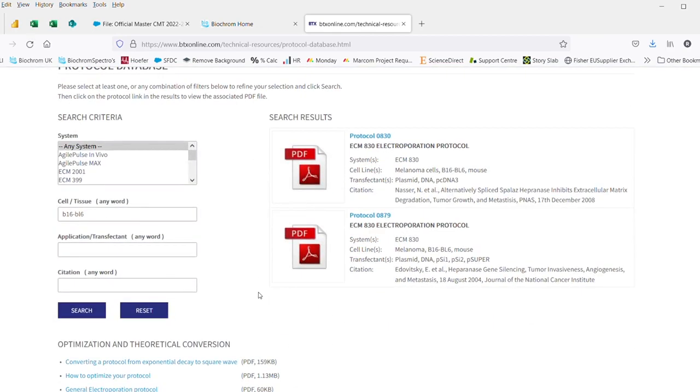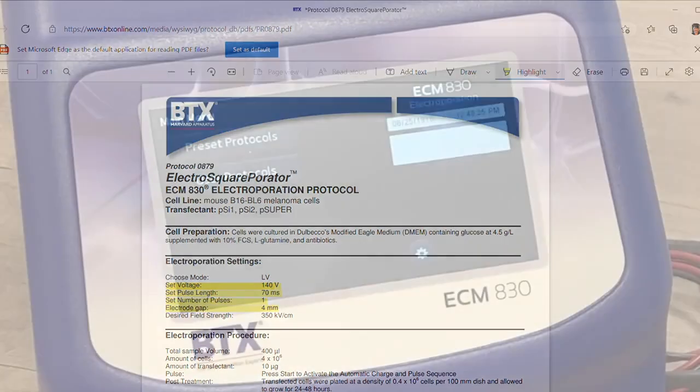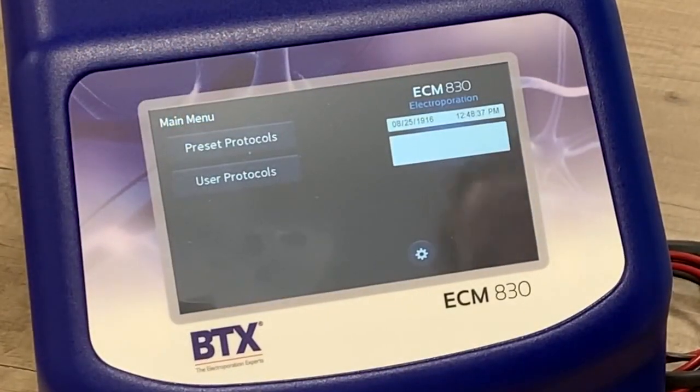As a guideline, choosing the most recent or the last in the line will give you the most up-to-date applications for that specific cell line. Once you get to the application note, you need to know the voltage, the pulse length, the number of pulses, and the electrode gap of the cuvette to have the starting point you need to program the instrument.